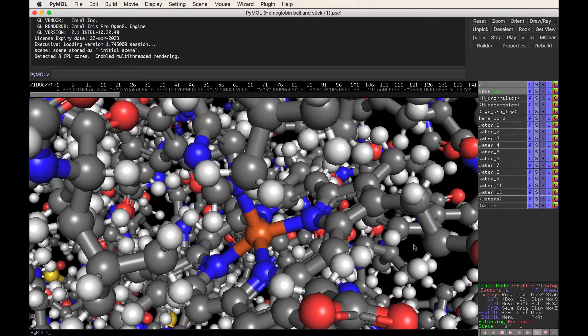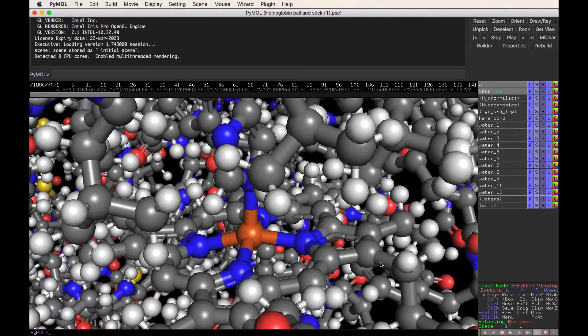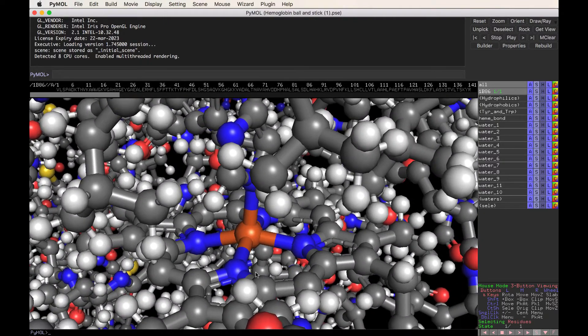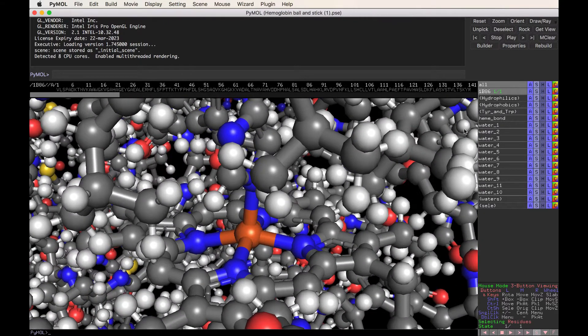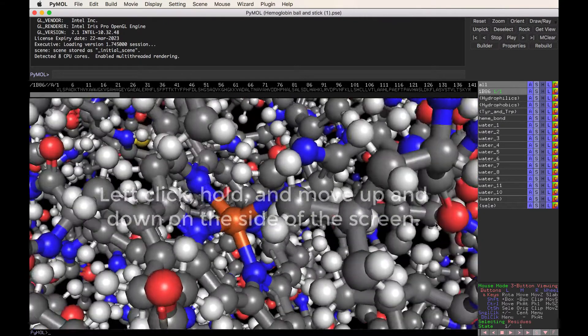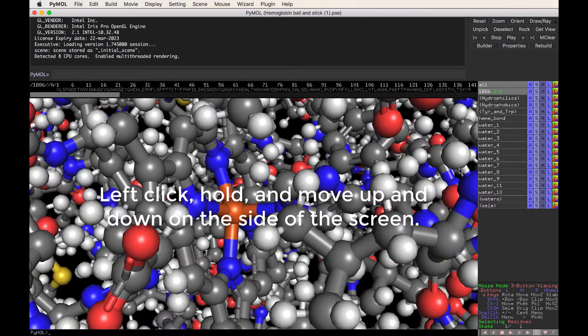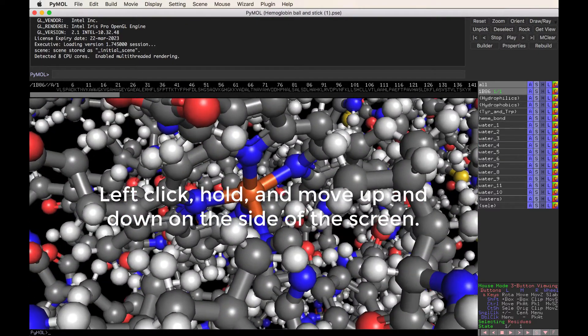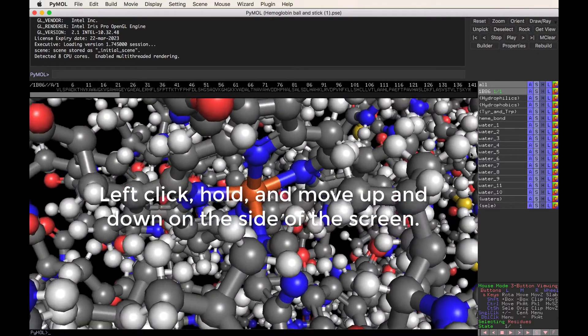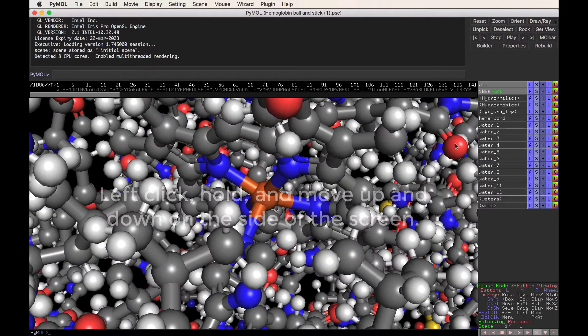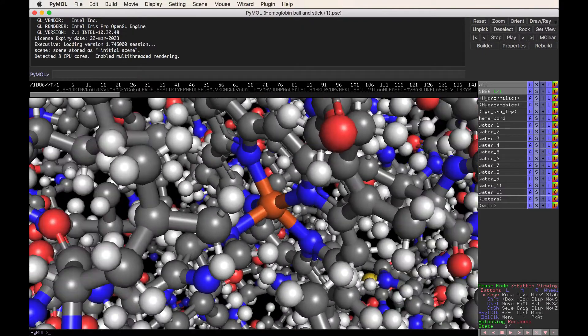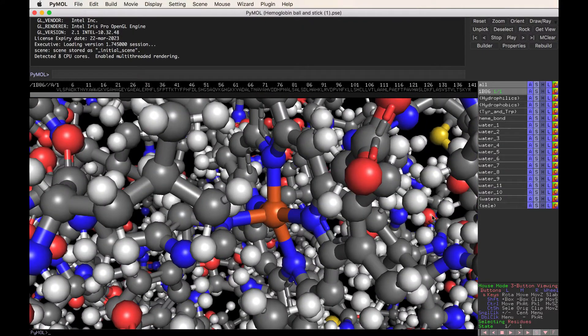So the iron in our blood is actually the iron that's held right here in the heme of the molecule. I'm going to teach you one other trick on how to manipulate the structure. If you left-click the corner of your screen or the side of the screen, you can kind of spin the molecule around. That's also something that's pretty useful to do.